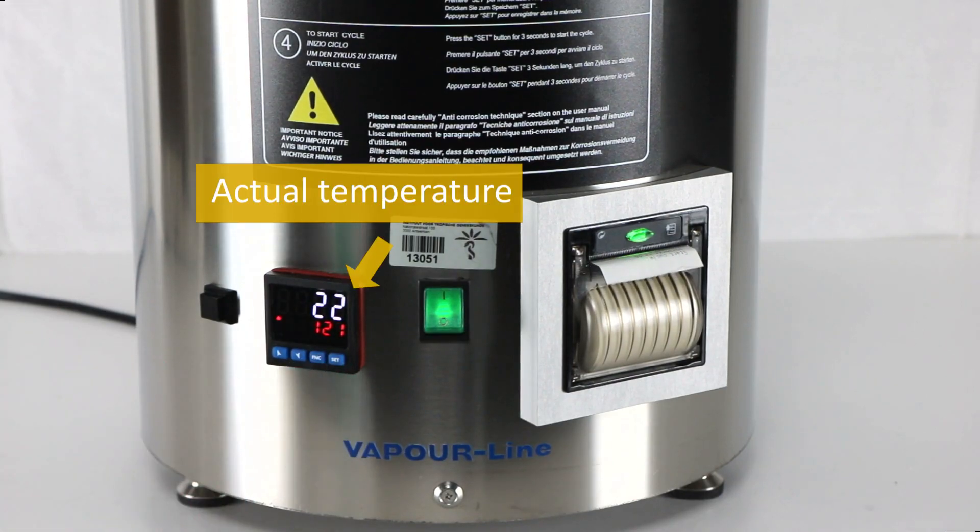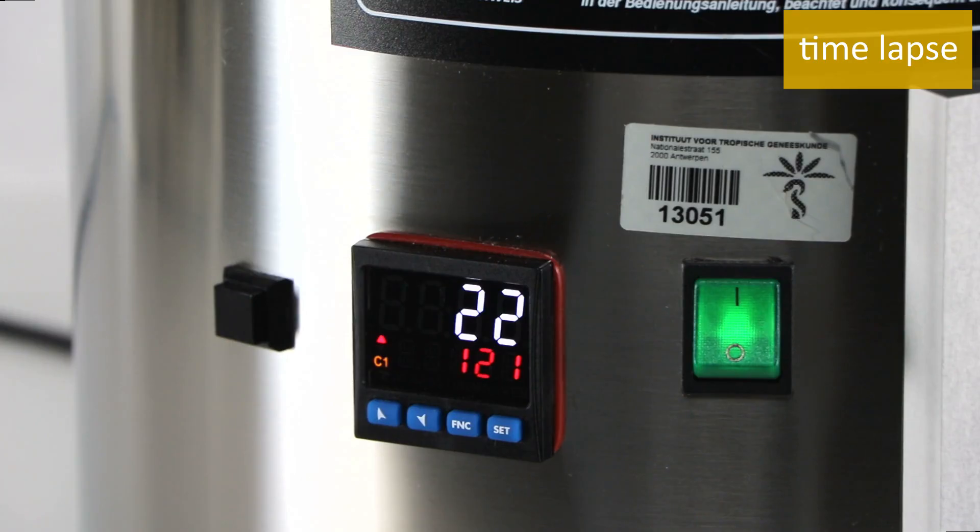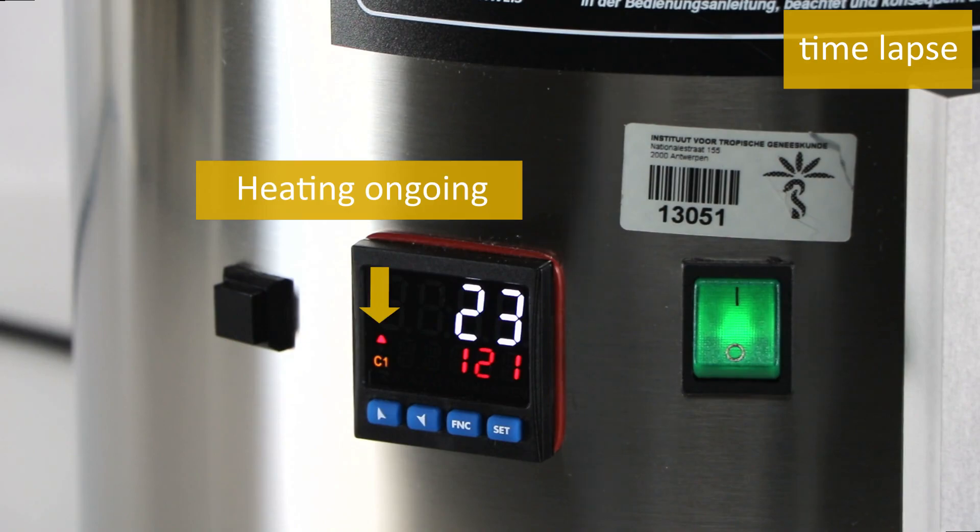If needed, adapt the parameters. Press the Set button for three seconds to start the sterilization cycle. The actual temperature is shown in the upper display (white), while the set temperature is shown in the lower display (red). A red arrow lights up to show that heating is ongoing.